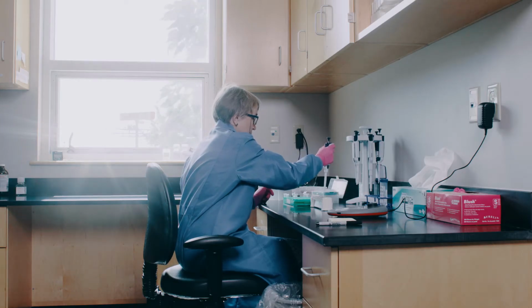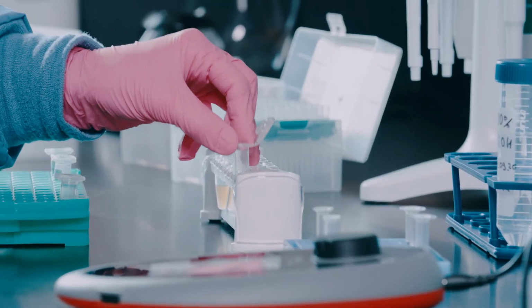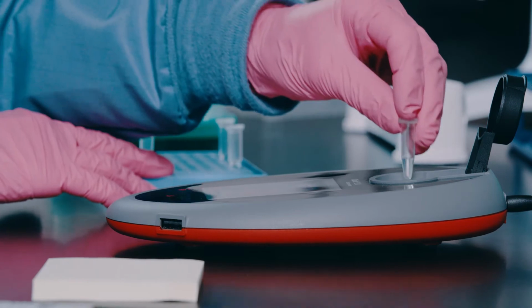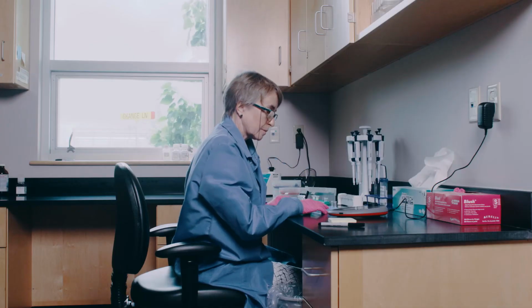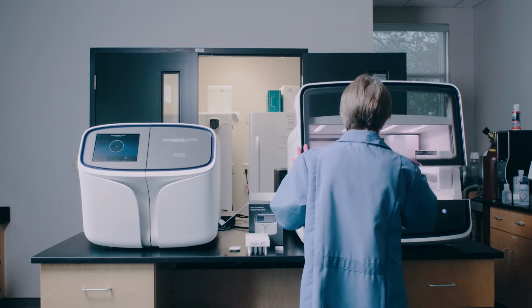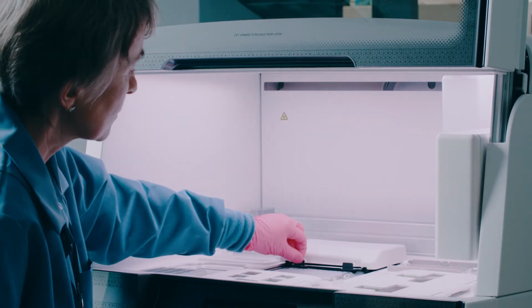Once that's done, we'll move on to the next generation sequencing, or NGS lab. We'll pool the plate into one tube and then purify it on a magnet. Then we take a sample and get a reading of how much DNA is in it, quantifying our library using a Qubit fluorometer. Next, we'll dilute it with water and put it in the Ion Chef system that templates and prepares a chip for sequencing.